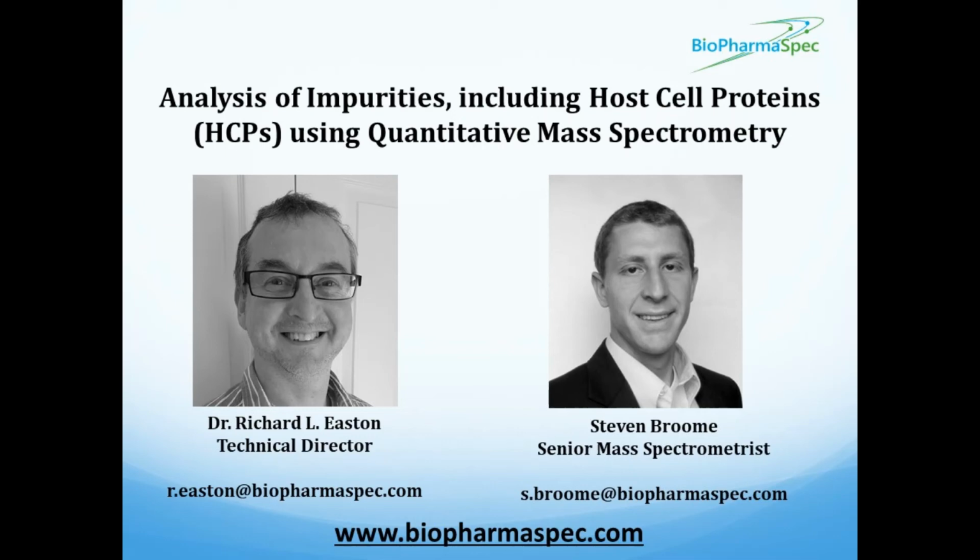On the other side, though, mass spectrometry can provide information that ELISA simply can't. For example, mass spec allows for the identification and quantification of specific proteins, whereas ELISA can only give you the total weight of all the proteins present. So it doesn't really give you any information about what those proteins actually are, whereas mass spec can give you that.